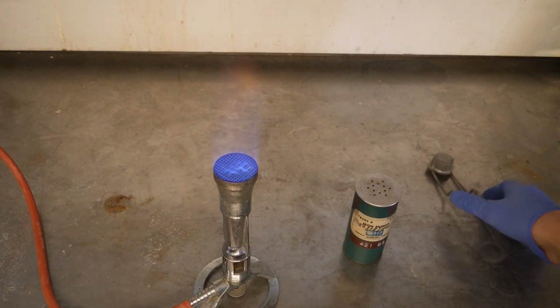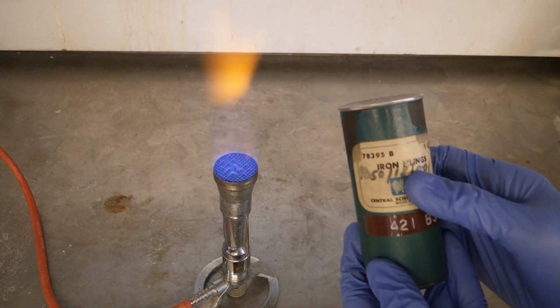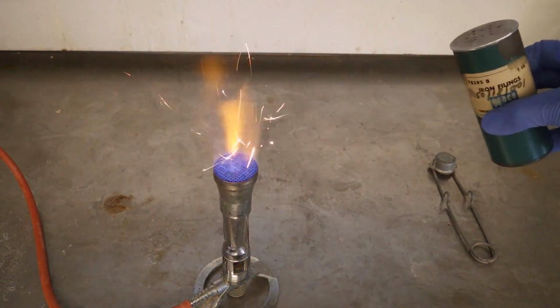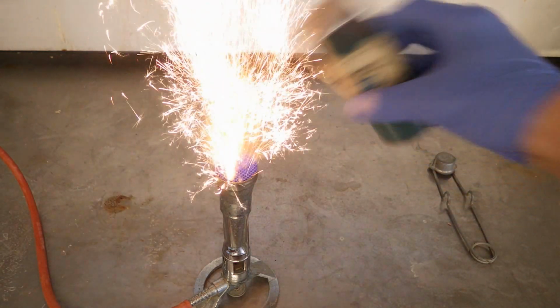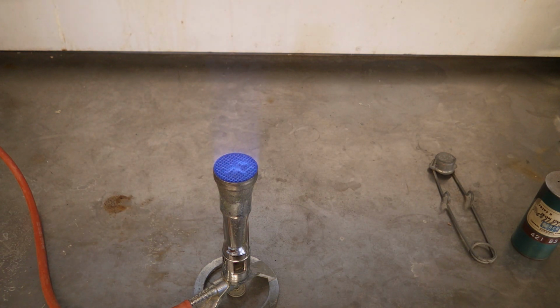Let's take a look at this reaction. Iron plus oxygen to produce iron oxide. Just need a little heat to get it started. That looks like pyrotechnics, doesn't it? Guess what? That's what pyrotechnics is. A metal plus oxygen producing a metal oxide.